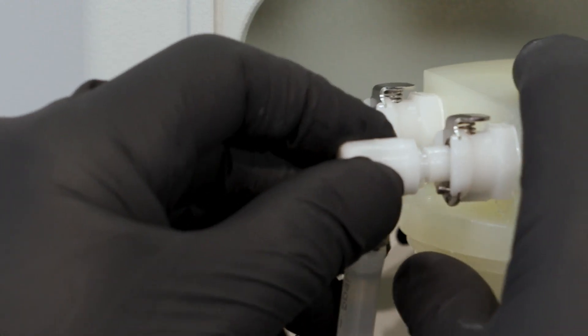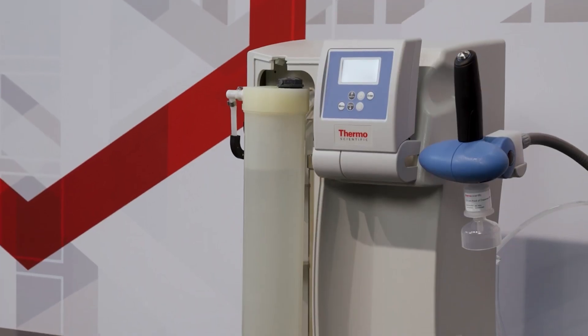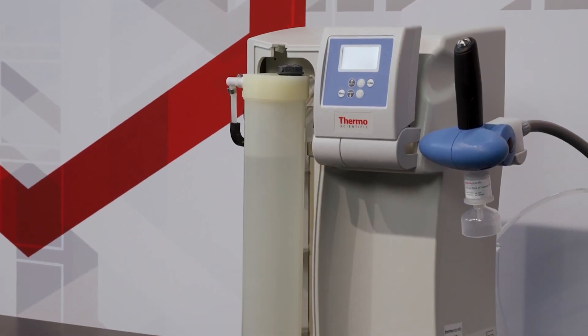Insert the quick connect couplings into the disinfection cartridge until they audibly click into place. At this stage, you can turn the water supply back on.